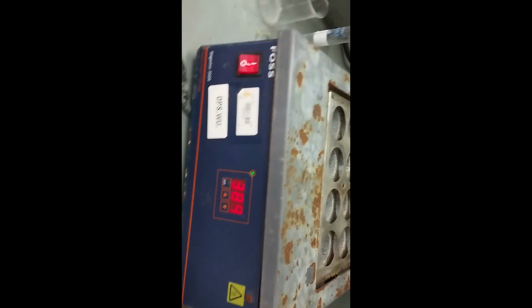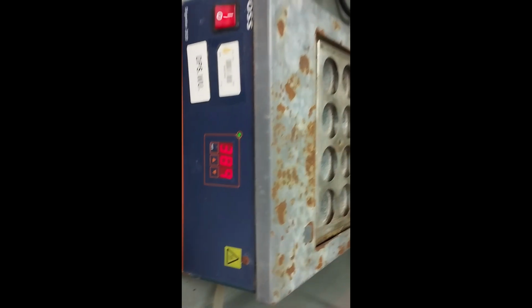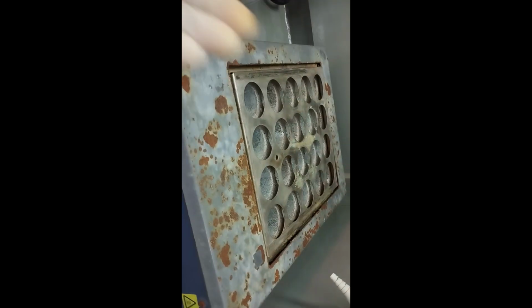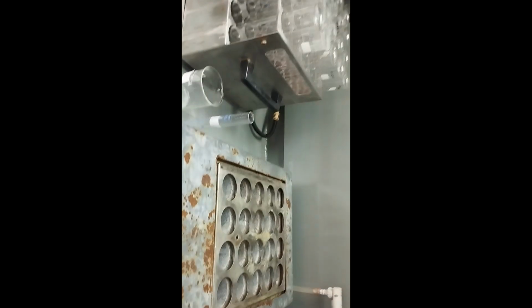And meanwhile I have turned on the hot plate and I am waiting for 420 degrees centigrade, and later I will put all these tubes on this chamber for the digestion process to start with the attachment of this. Okay, this sample is dark brown. Now put on the hot plate.